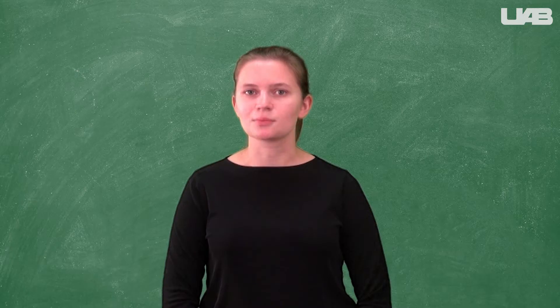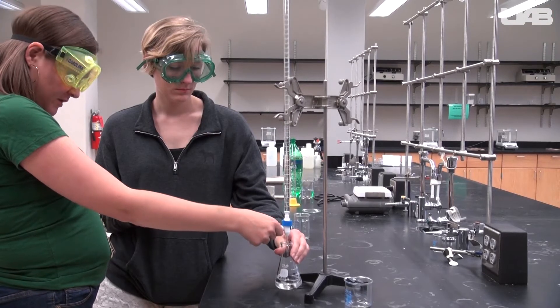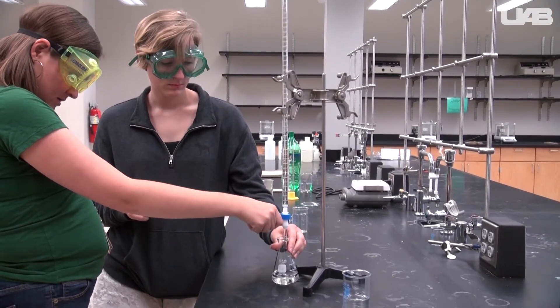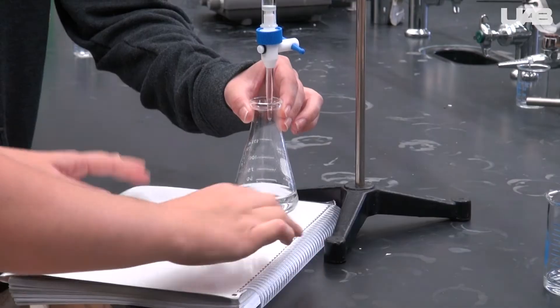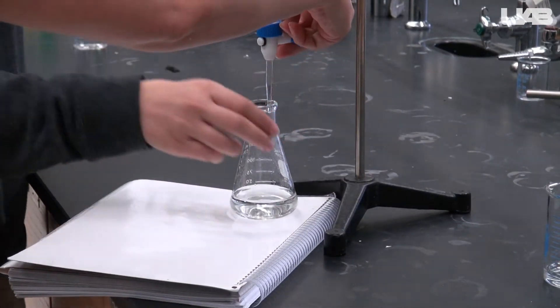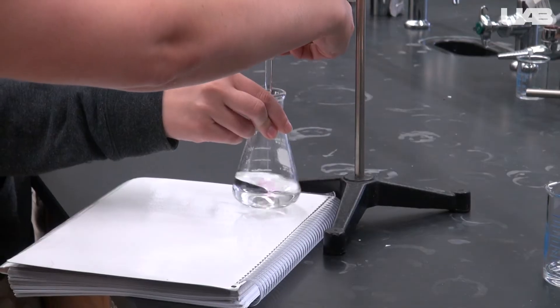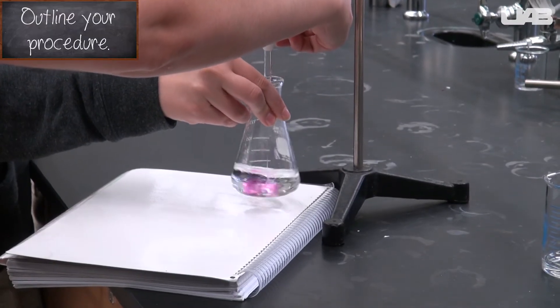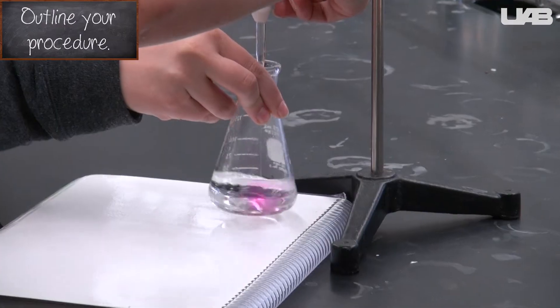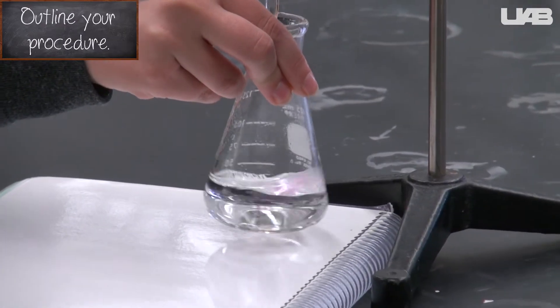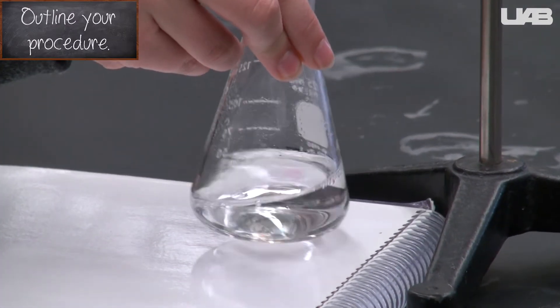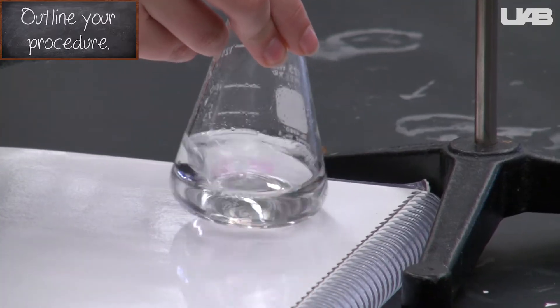Until you have had some practice with titrations, it would be wise to let one group member control the stopcock and the other group member hold the flask. Open the stopcock to allow the sodium hydroxide to flow out while swirling the Erlenmeyer flask. You can let it flow out fast at first, but when you start to see pink where the drops are splashing in, you should slow down and go more dropwise by turning the stopcock to a more vertical position.